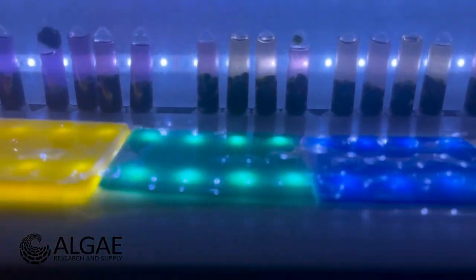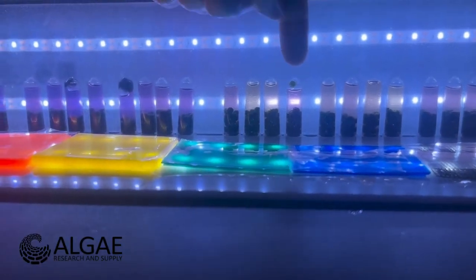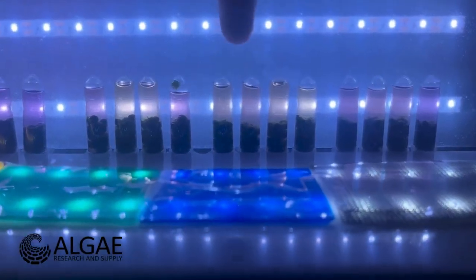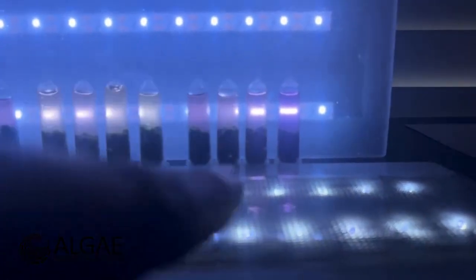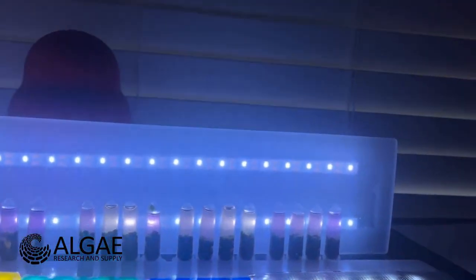And then we have the green that you can see these 2 have a little bit of a change and these pretty much none. The blue, I'm surprised as well. We only see a little bit of color change in the blue, and in the white we see less color change than we did in the red. I have a theory about that.